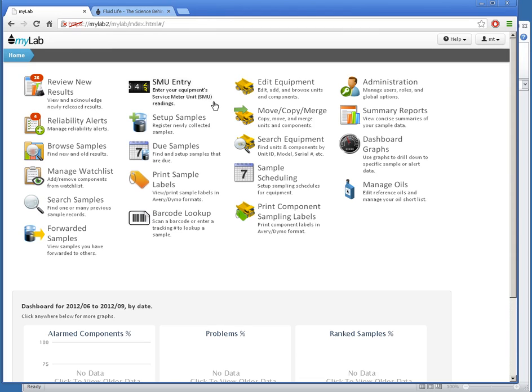Hello. In this video, I'm going to show you how to find and export sample results in FluidLife's MyLab. To export results from one component, I start by locating the component in Browse Samples.